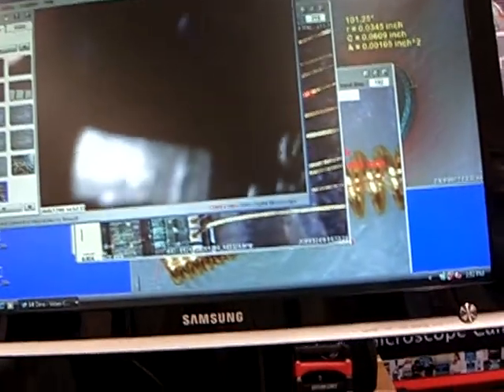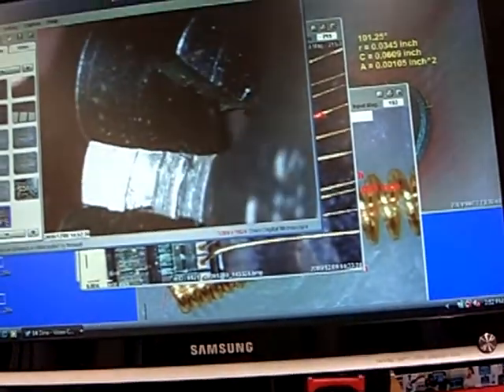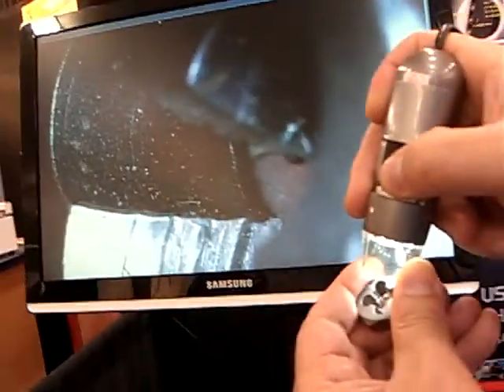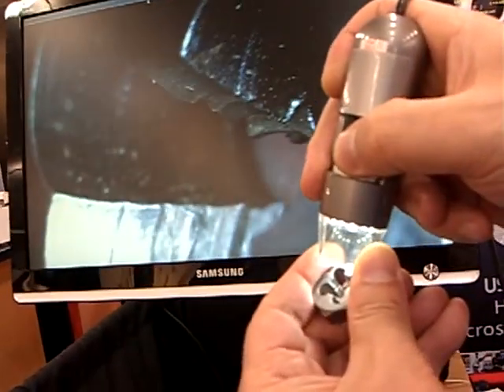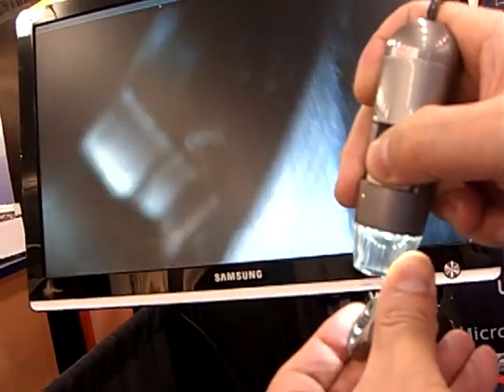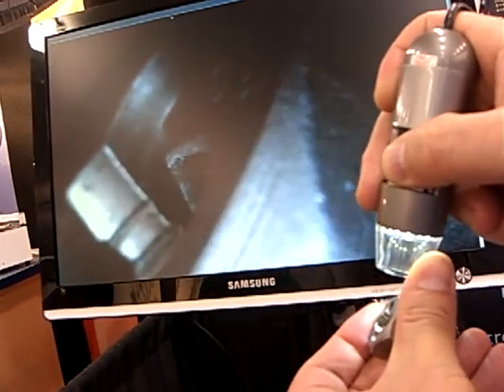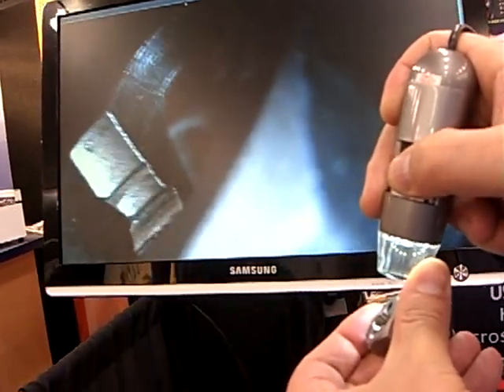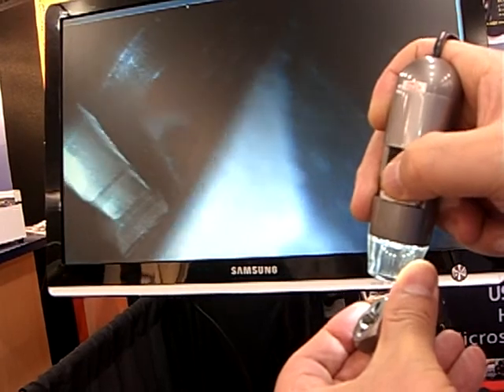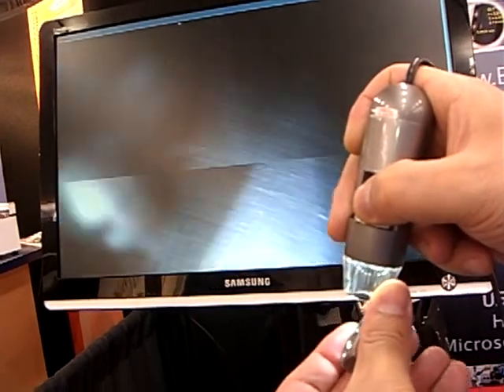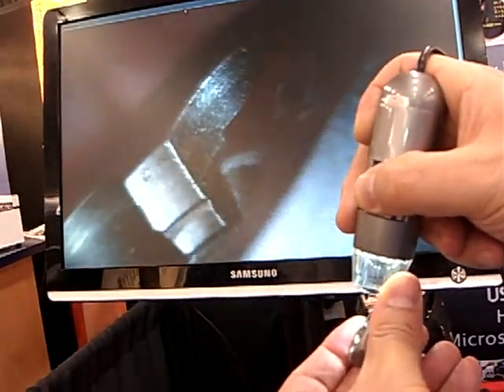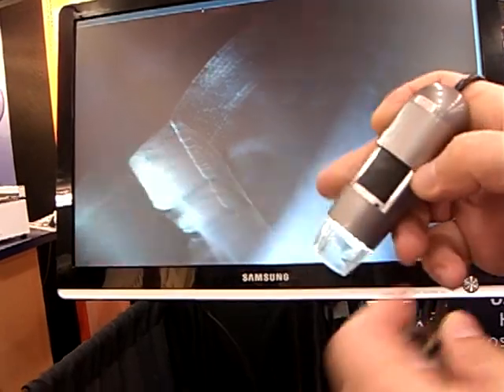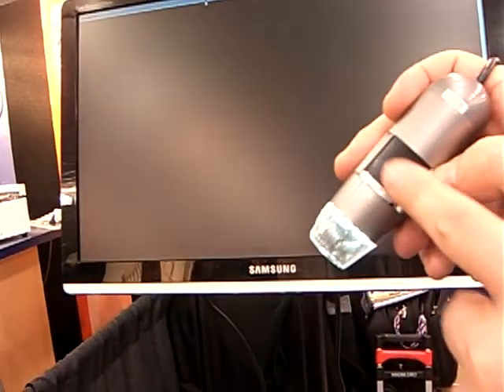To see the back, view the full screen. You can rotate to see different areas of the lens and refocus. Focus the front, focus the back. Rotate the lens and travel up and down to get different focus points and locations.